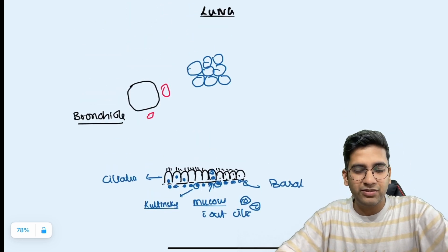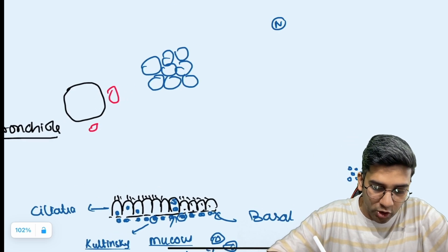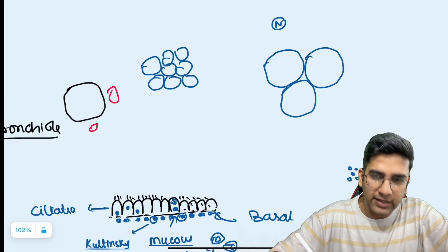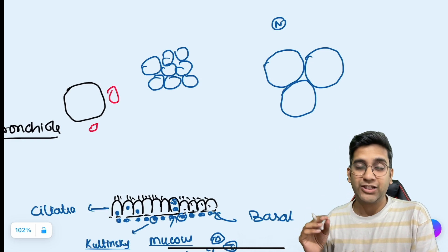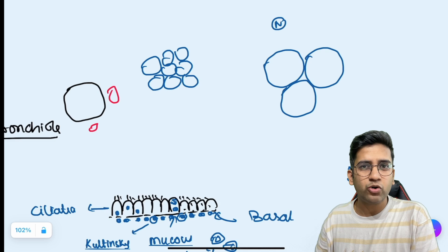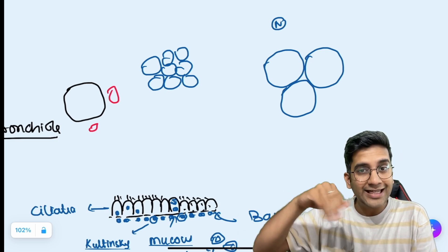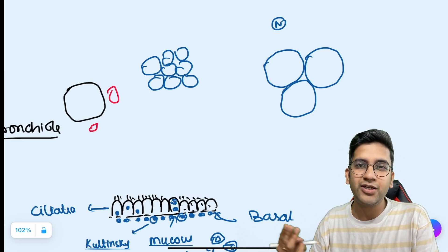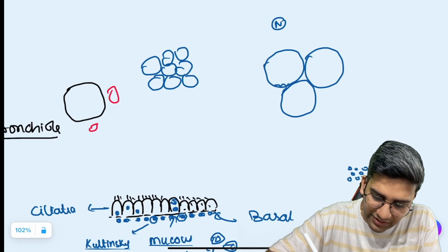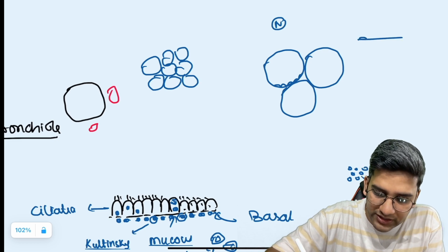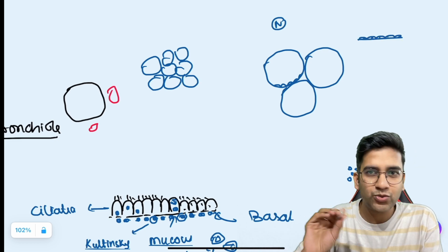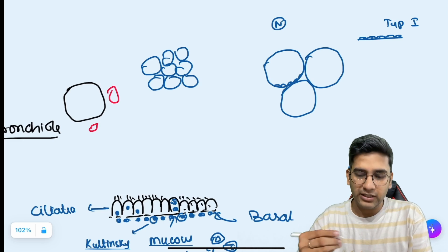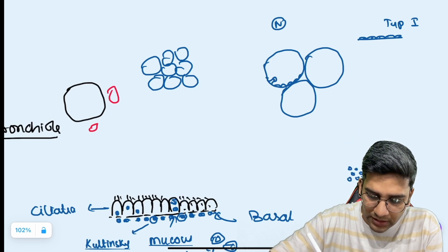Now looking at the alveoli — as I said, it's a pretty simple structure. The alveoli will be separated by very thin fibrous septa. In a normal lung you won't see much in the interstitial space; if it's fibrotic, yes, you might have thickening. The lining epithelium of the alveoli consists of type 1 and type 2 cells. Type 1 helps in air-gas exchange and is very flat, with tiny nuclei.